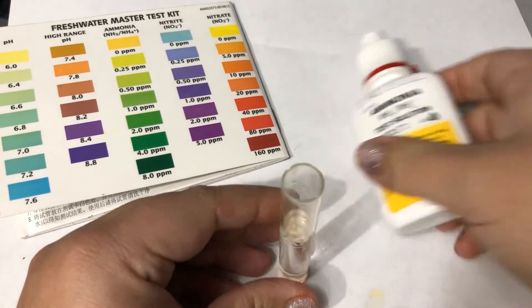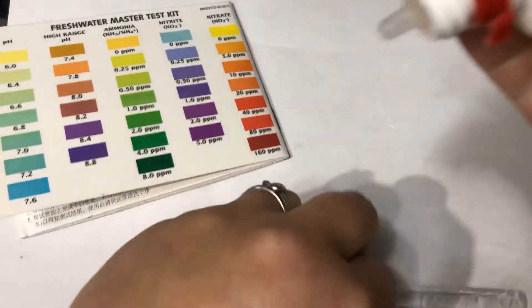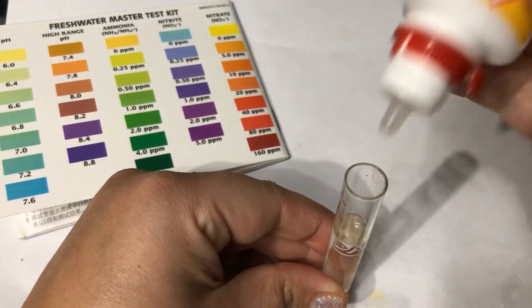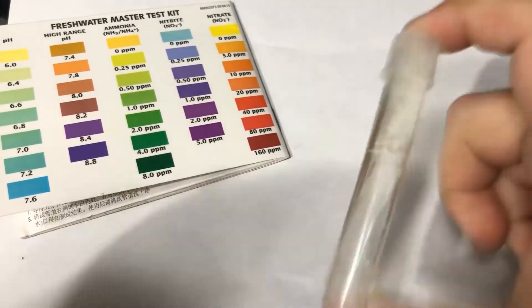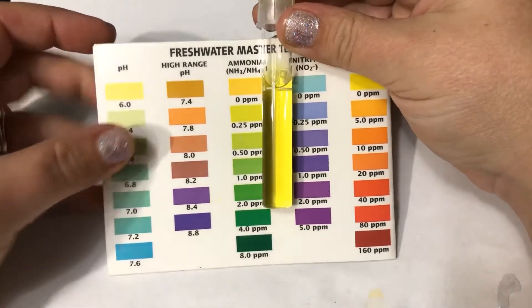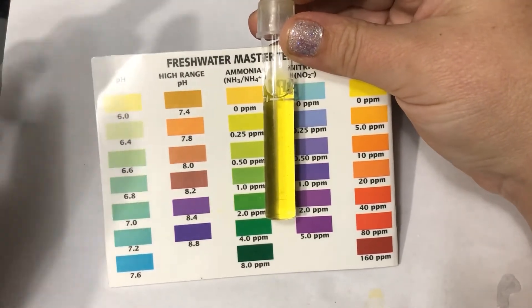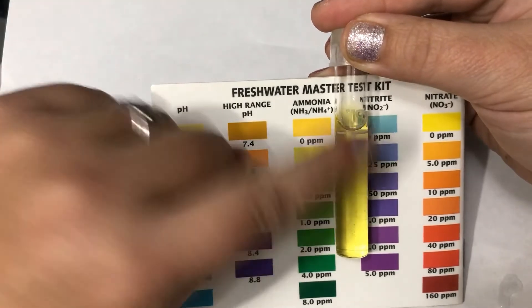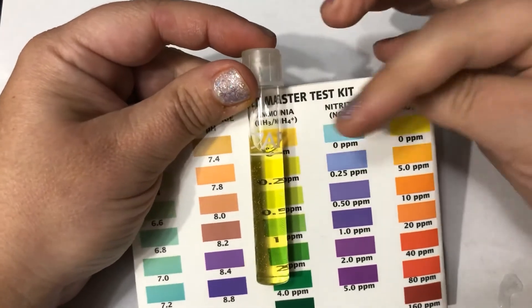I've added eight drops of bottle one, and now I'm going to add eight drops of bottle two. I'll put the cap on and shake it vigorously for five seconds. After letting the ammonia test set for five minutes, you can see it's a yellow color right at zero heading into 0.25. We need to get some ammonia starting so our good bacteria have something to eat. That good bacteria will eat the ammonia, and we should start to see ammonia go up, then down.